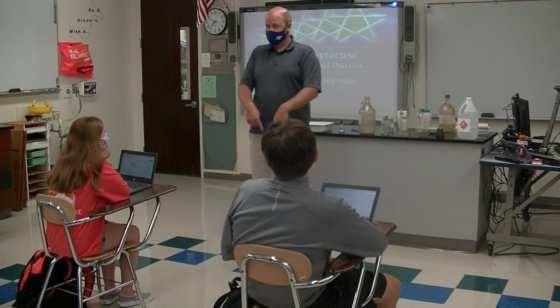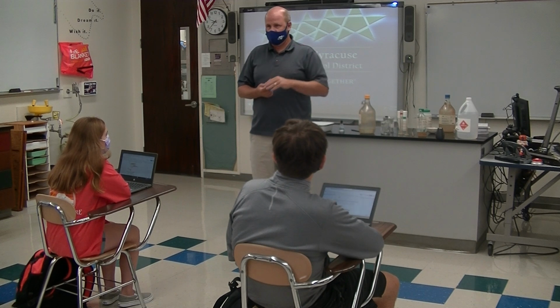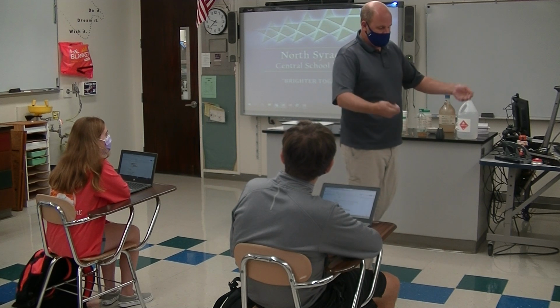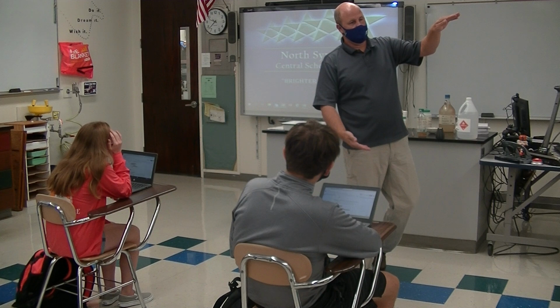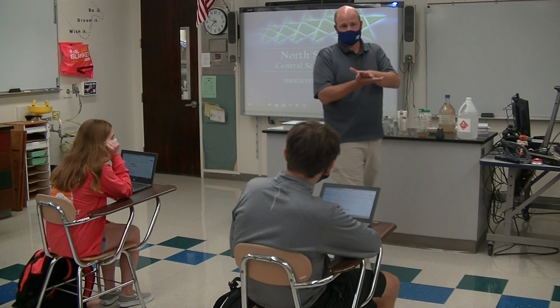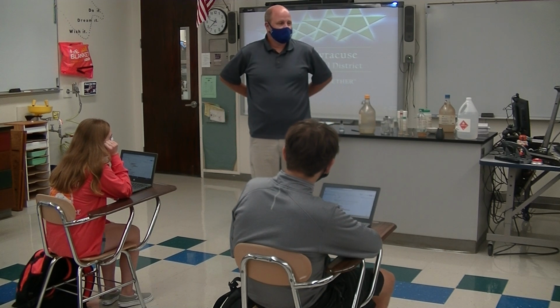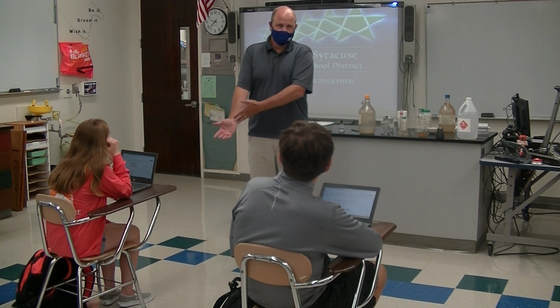The person who was teaching in this room smelled that acid within like 30 seconds. So she went out of this room, went across the hall, and went into the door. Well, the acid was on the floor right there. She slipped. Up, feet up, on her back, and slid down the hallway into the other teacher. So now you had one teacher with acid down the front of her, from the waist down, the other teacher with acid all over their backside. What does that new teacher now have to do?